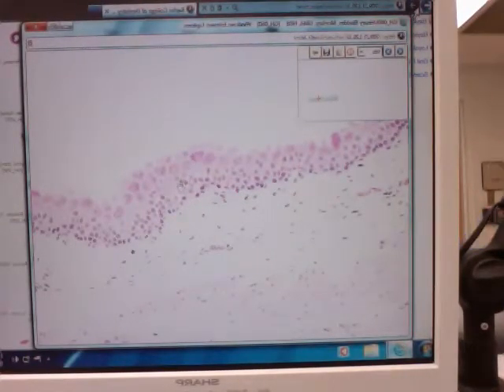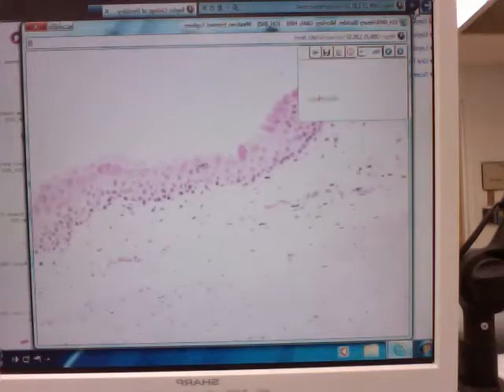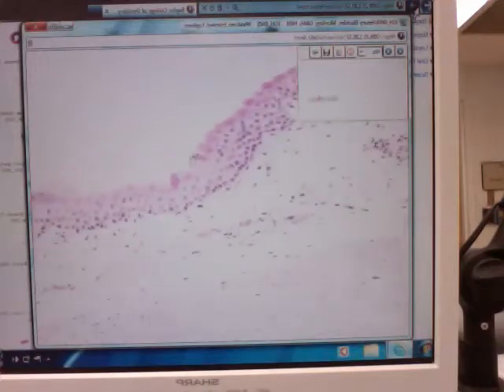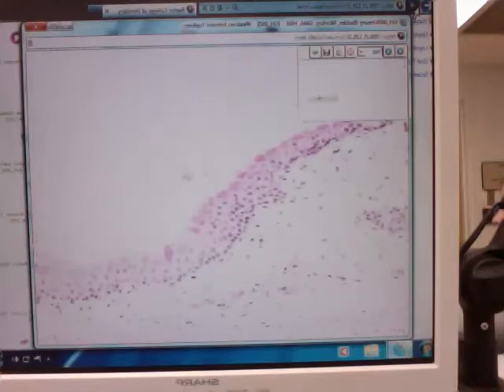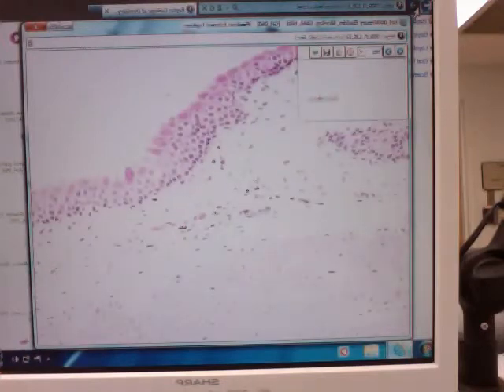It's not going to be stratified something because this is an epithelium that transitions in state from being balloon-shaped, as it is here in the relaxed state, to squamous in the fully distended state, and we only do this relaxed state transitional epithelium. So when you look at this, these big puffy cells on the outermost layer are a dead giveaway for that. Now, when we look deep to this, there's connective tissue below it.